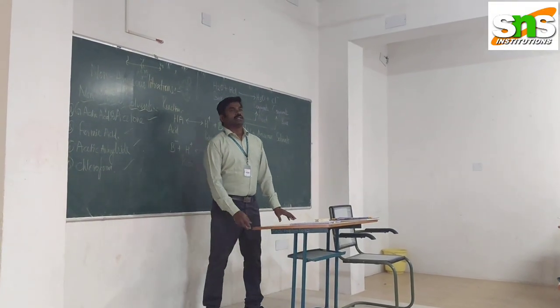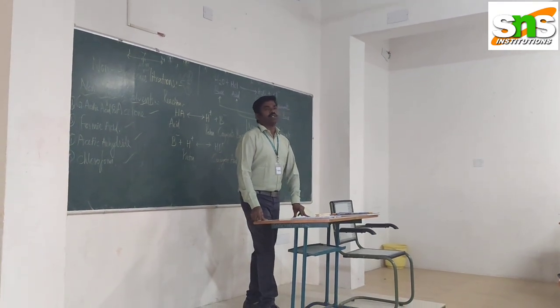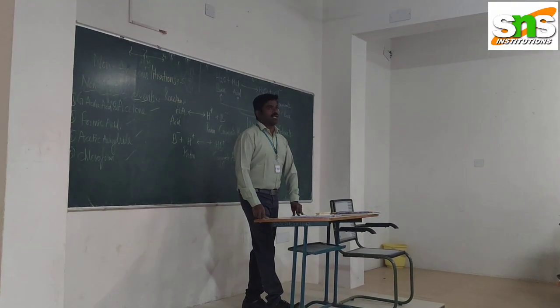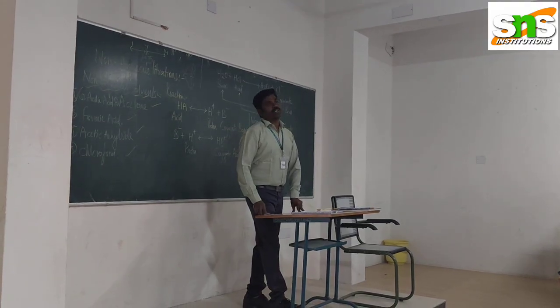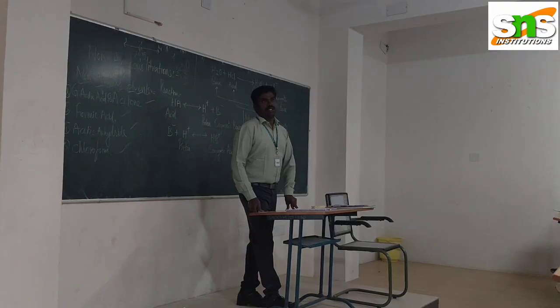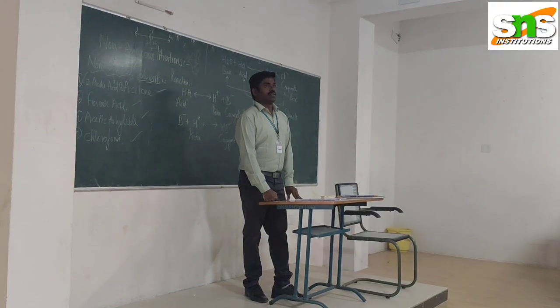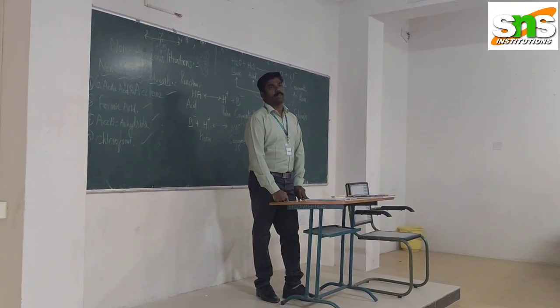The first is that the drug or organic synthetic compound or API is insoluble in aqueous solvent or water. If the drug has low solubility in water, such drugs, we give preference to non-aqueous titration.